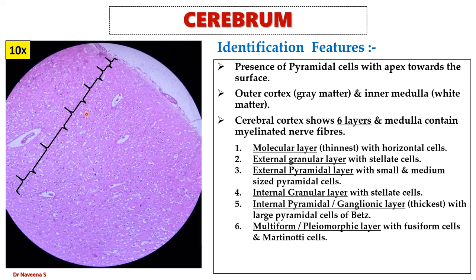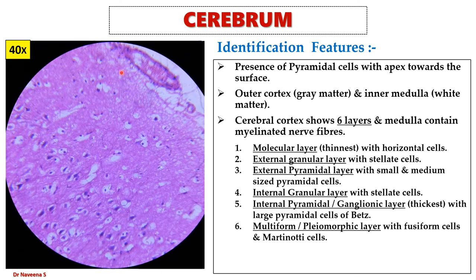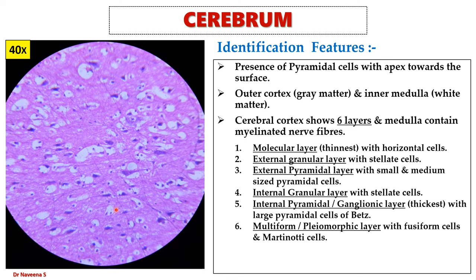Let's see the cells of different layers of the cerebral cortex under high magnification. Here is the outermost molecular layer with horizontal cells. Here is the external granular layer with stellate cells, which also shows small-sized pyramidal cells very few in number. The third layer, external pyramidal layer, shows small and medium-sized pyramidal cells, with very few stellate cells. The fifth layer, internal pyramidal or ganglionic layer, shows large pyramidal cells — these are cells of Betz. The deepest layer, multiform or pleomorphic layer, shows fusiform cells and larger cells of Martinotti.